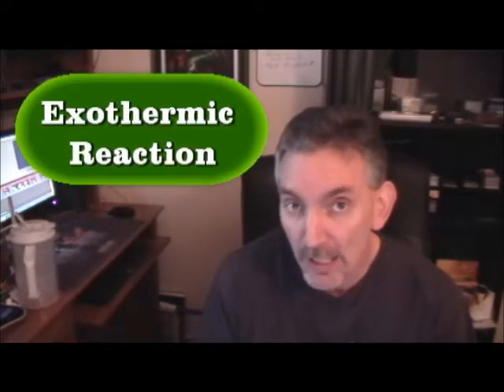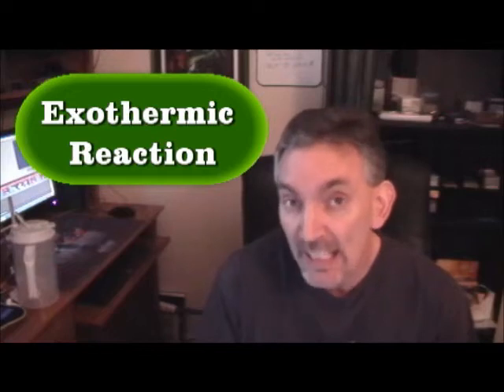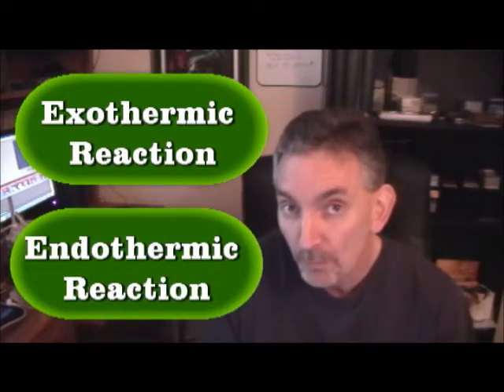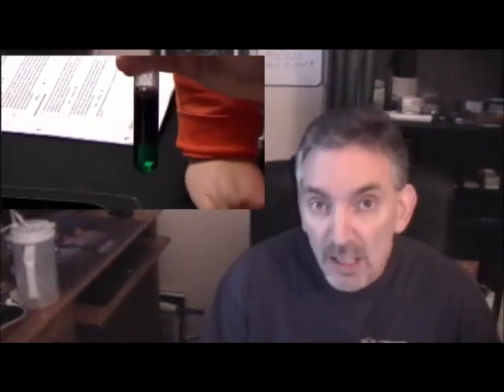Remember that reactions either give out energy, which we sometimes call exothermic reactions, so the test tube might feel very hot. And some reactions absorb or take in energy to make them go. So as they take that energy in from their surroundings, sometimes the test tube will feel very cold to the touch. There could also be the production of a gas during the experiment. And for your experiments this afternoon, you're looking at the production of 3 specific gases.